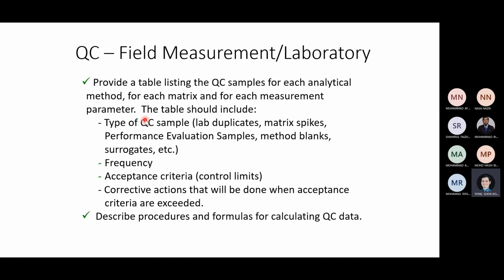And having an instrument, it's only natural that you need QC in determining its accuracy and precision. So a lot of calibration might be involved. You're going to use a lot of standards to calibrate your instrument. And perhaps not just the instrument, maybe the operator also, because different people may have different ability and knowledge in conducting any procedure, either in the lab or in the field.